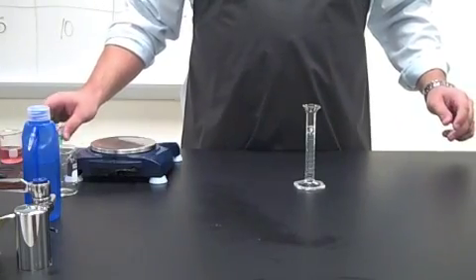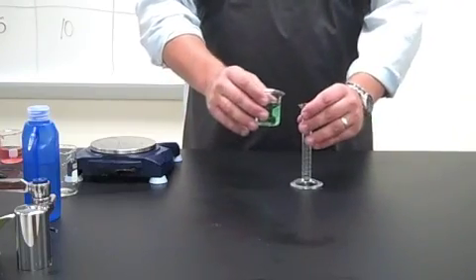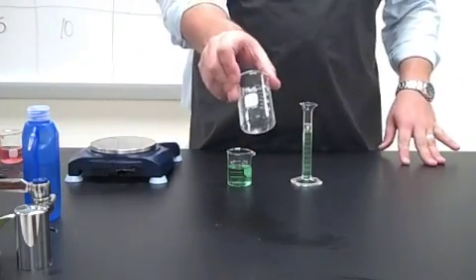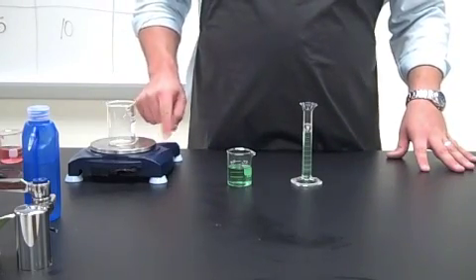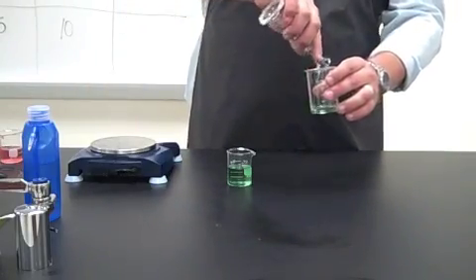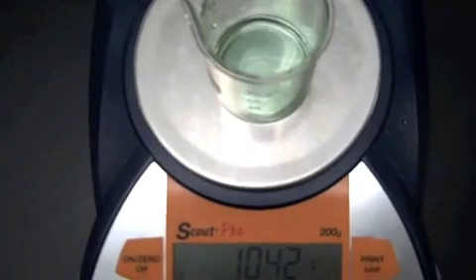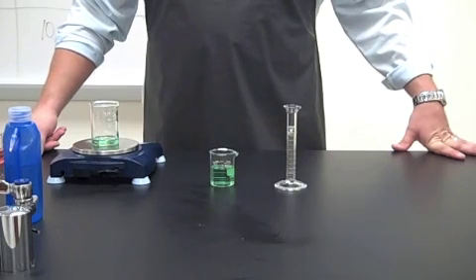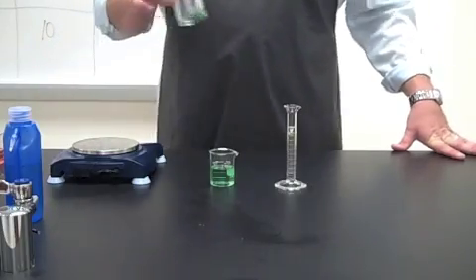Now we're going to measure the green, or the 15% mixture of sugar. Go ahead and pour 10 milliliters again. And again we're going to add it to our 100 milliliter beaker, put that on the balance, zero it out, add it to our beaker, and record the mass. And we see it has a mass of 10.42 grams. Pour it down the drain.